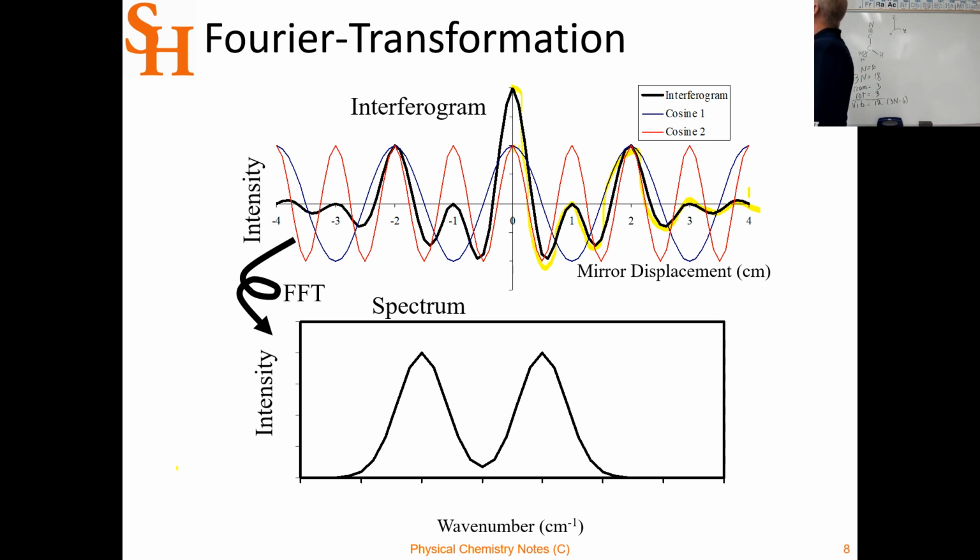Now that interferogram that I've traced out shows up as a function of mirror displacement. And so as the mirror moves left from the zero displacement difference, so in the middle is what we call the center burst. That's when both mirror path lengths are the same. And then as the mirror displacement moves, the path gets longer and then it gets shorter when it goes past. But when it hits the zero displacement difference, all the light recombines.